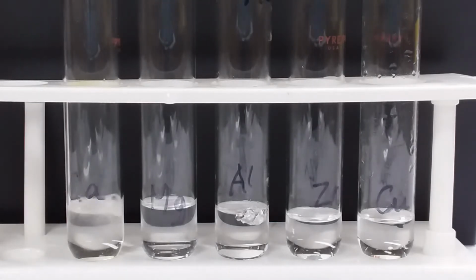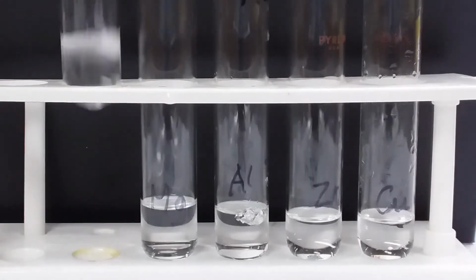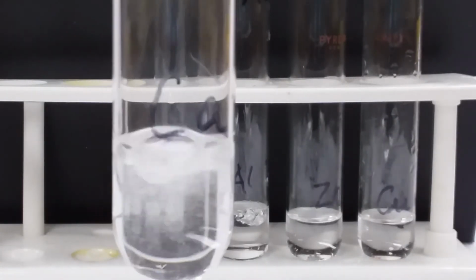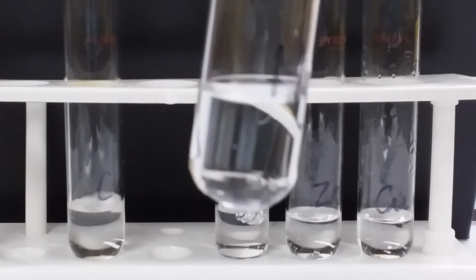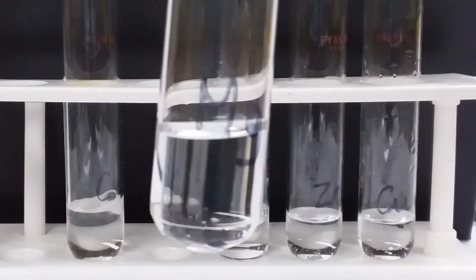You could already see which ones are producing bubbles. Calcium is reacting very rapidly, as we would expect. The magnesium metal, it was a small piece of magnesium metal and it has all reacted.